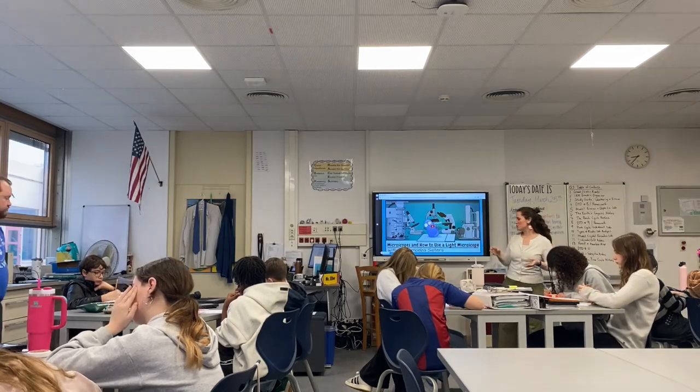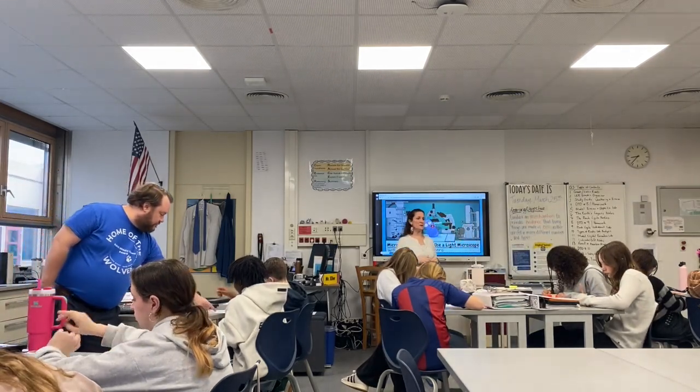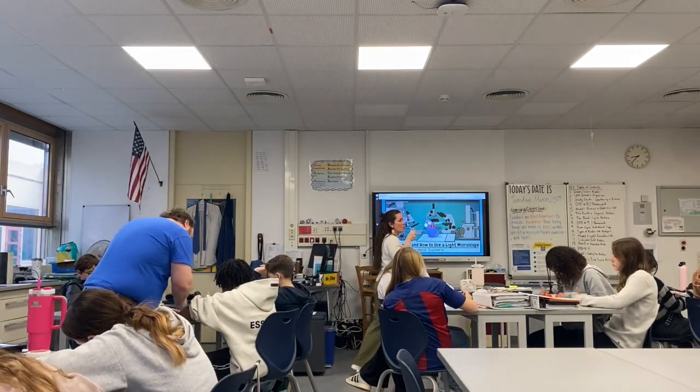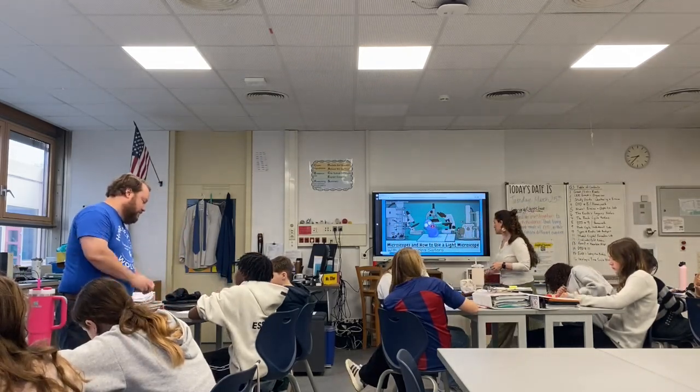So you want to make sure, once you find your specimen, and we'll talk about this when we do our lab, once you find it with the 4x, you shouldn't need to move the coarse knob. You should only need to use the fine focus knob. Okay, so that was part of that.